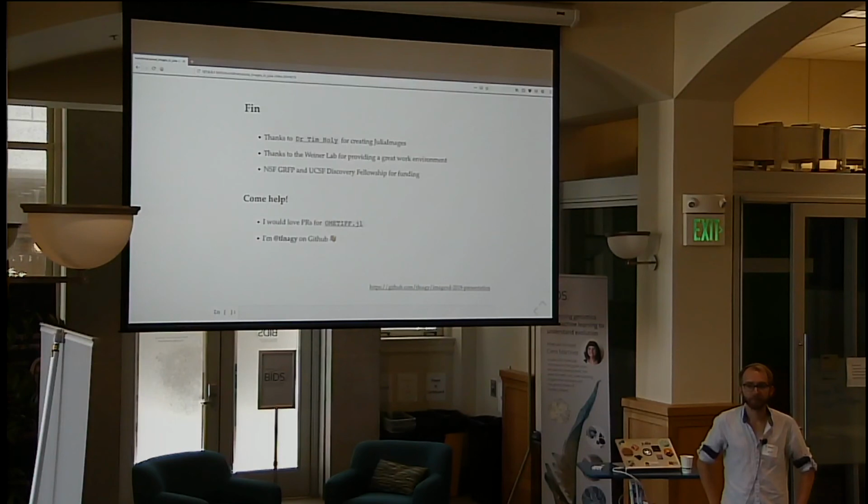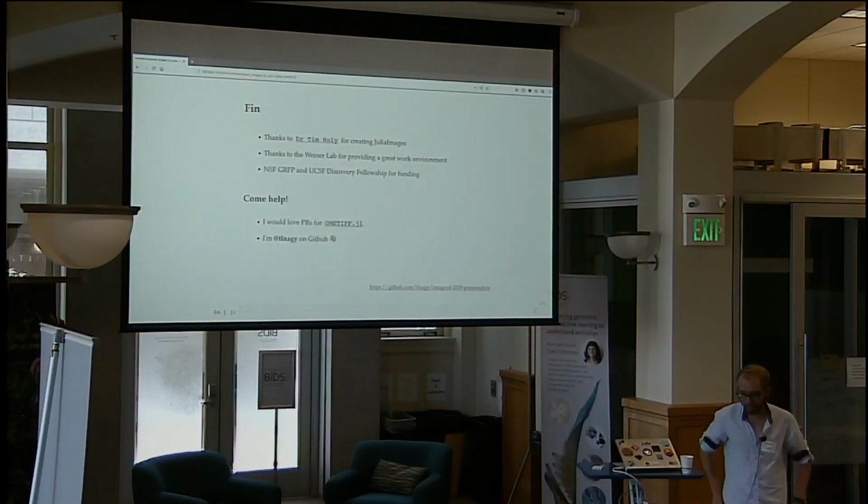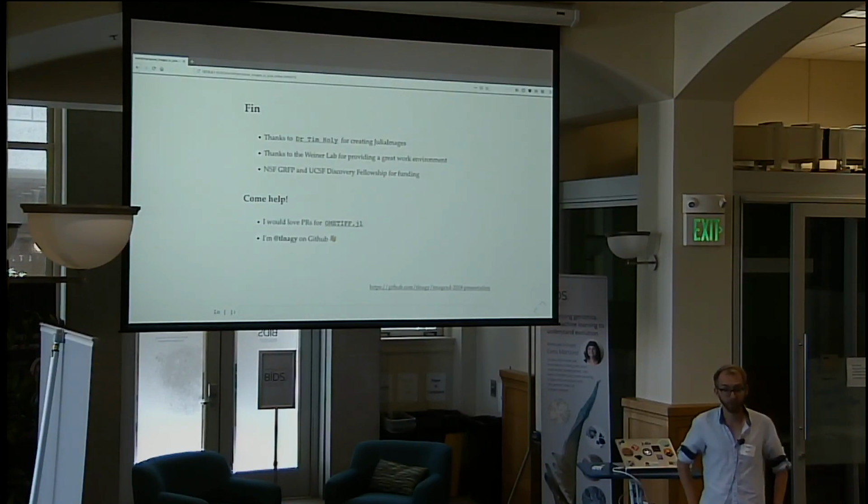Do you also have all these capabilities as part of Julia for image processing? What's the stage? Certainly there's a lot of the basic stuff: basic edge detection, Gaussian blur, and applying arbitrary kernels to your images is extremely fast in Julia.